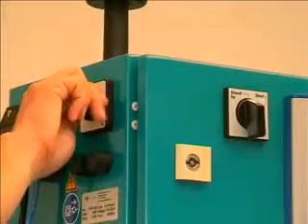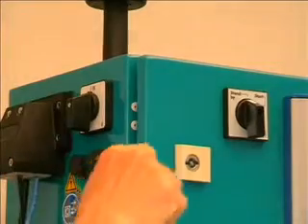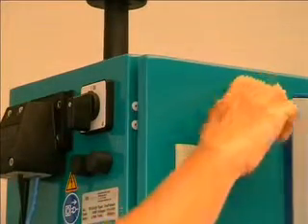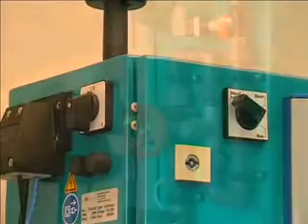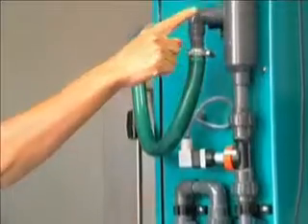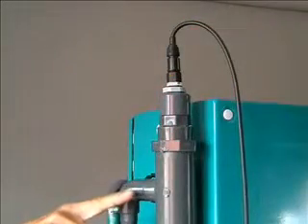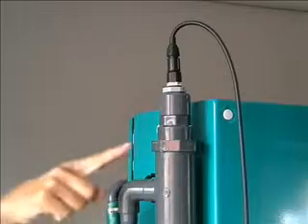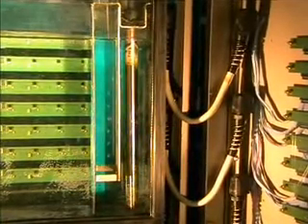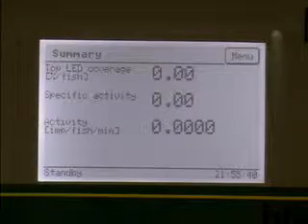The instrument is started by activating the main power switch on the left of the instrument and the mode selector switch on the front panel. On the right-hand side of the instrument are the sensors, the flow control and, if required, the dechlorination system. There is also a heating element located at the right-hand side of the aquarium. All adjustments, user inputs and visualised measurements are accessible via the touchscreen in the front panel.